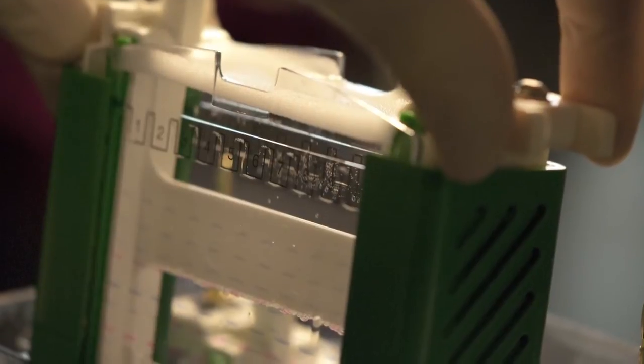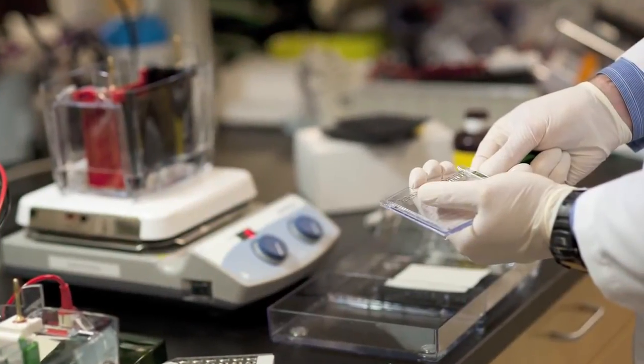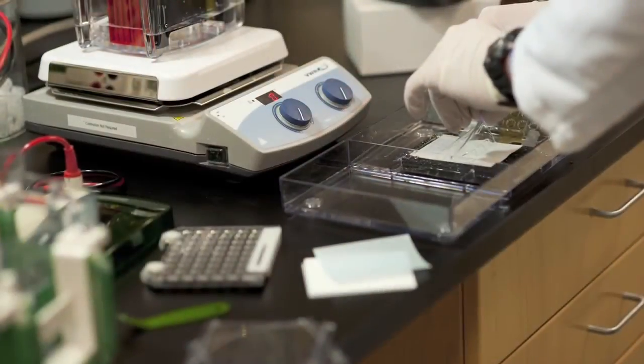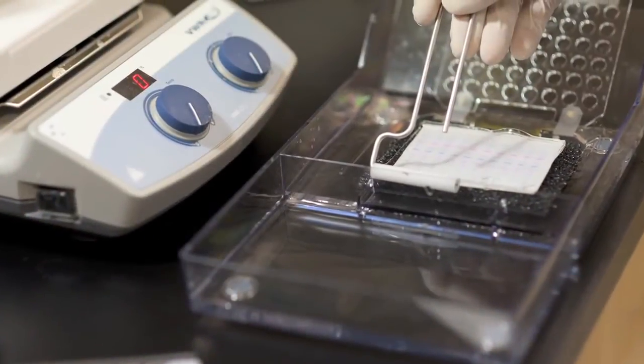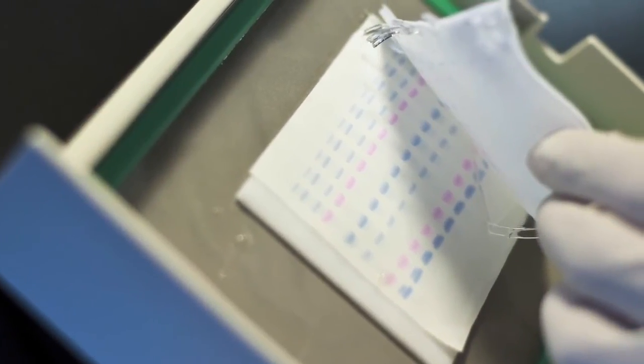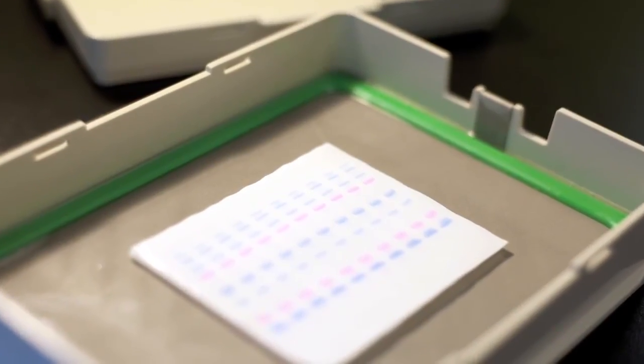We found the gels to be very reproducible in the times that we have used them. We've gotten excellent scores of the proteins and were able to identify more proteins than on comparative gels, or in that case also by a gel-free approach. The gels were easy to use, but more importantly the migration pattern was very high resolution, the run time was short, and finally the sensitivity of the gels following transfer for Western blot detection was exceptional.